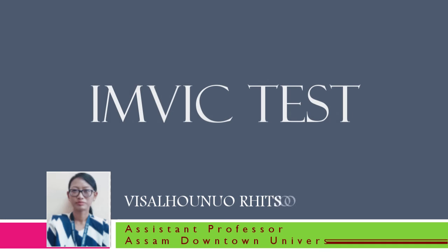In this video, I'll be explaining the IMViC test. IMViC stands for Indole, Methyl Red, Voges-Proskauer, and Citrate Utilization Test.